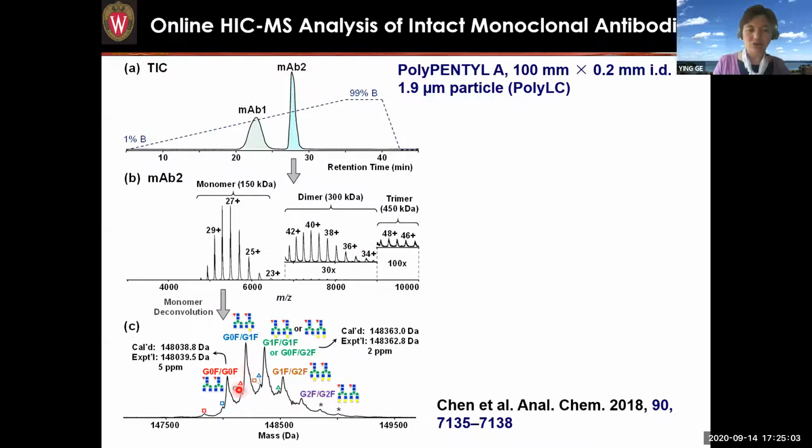We also can show the different glycosylation forms. And this data was actually acquired on a Maxis QTOF. We're pretty excited about the high accuracy.